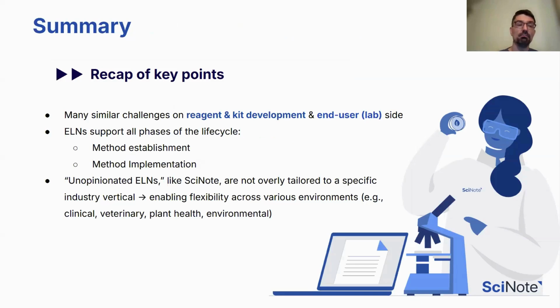We saw that there's quite a bit of similarities on the reagent manufacturer, kit manufacturer, and the end user side. We also saw that the ELN can actually support a majority of the phases of the method development lifecycle, including the establishment and then the implementation.